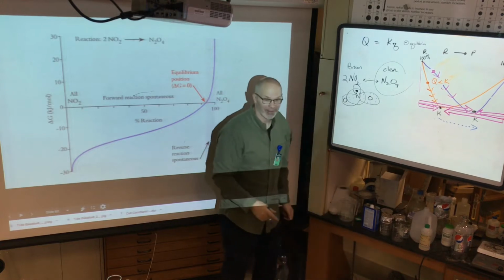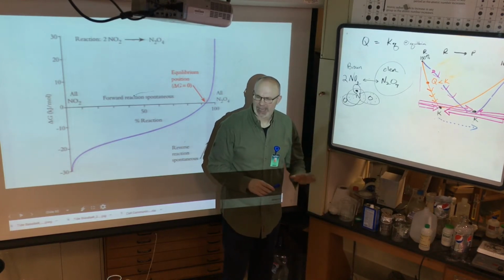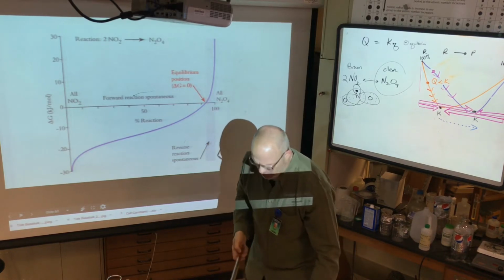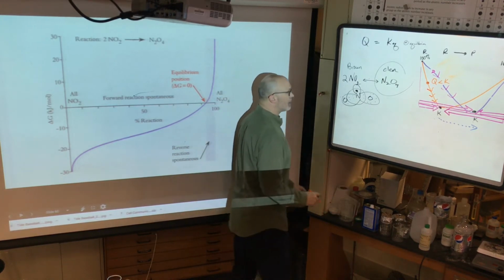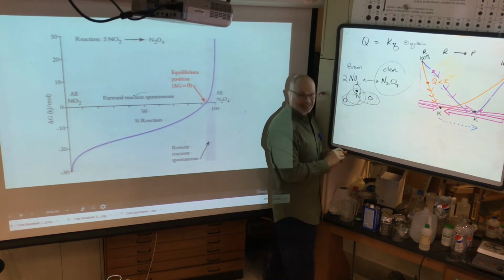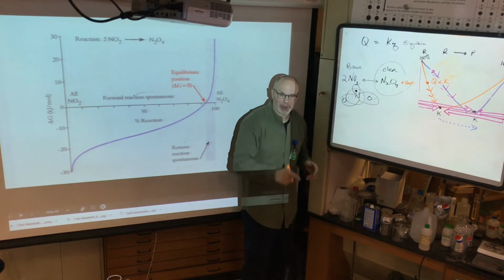It went clear. Hey, wait a minute. I took away the temperature. By taking away the temperature, what did I just do? Yes! Where do I put the heat? Where do I put the heat? Aren't I favoring the forward direction? Right! The heat belongs here. The forward reaction must be exothermic.